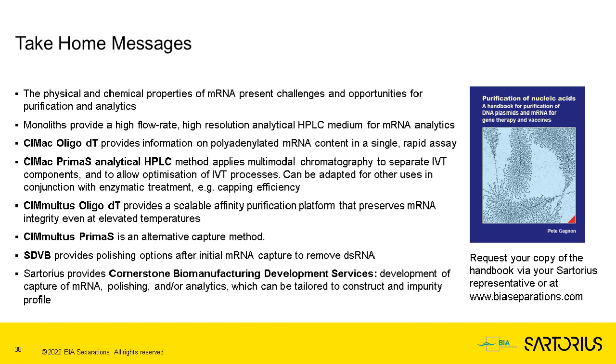Can a quaternary HPLC be used for the Prima S analysis? Yes, in fact, that's a stipulation. Quaternary HPLC should be used for this analysis, mostly from the perspective of the need for regeneration of the column between the runs.